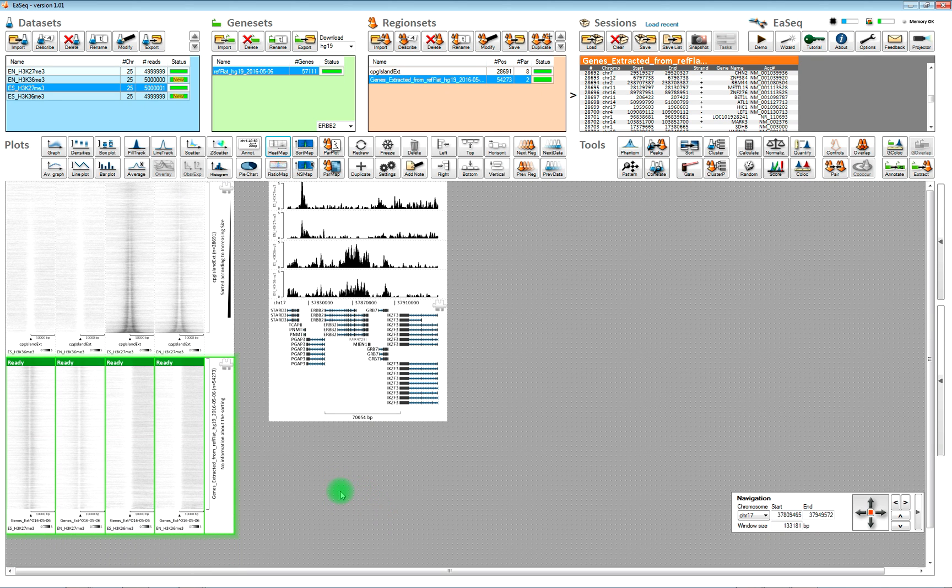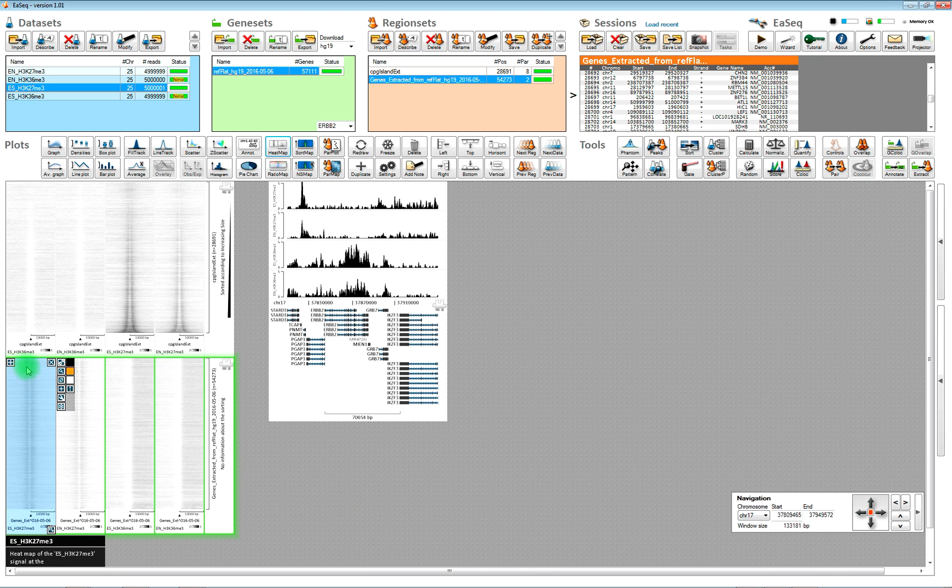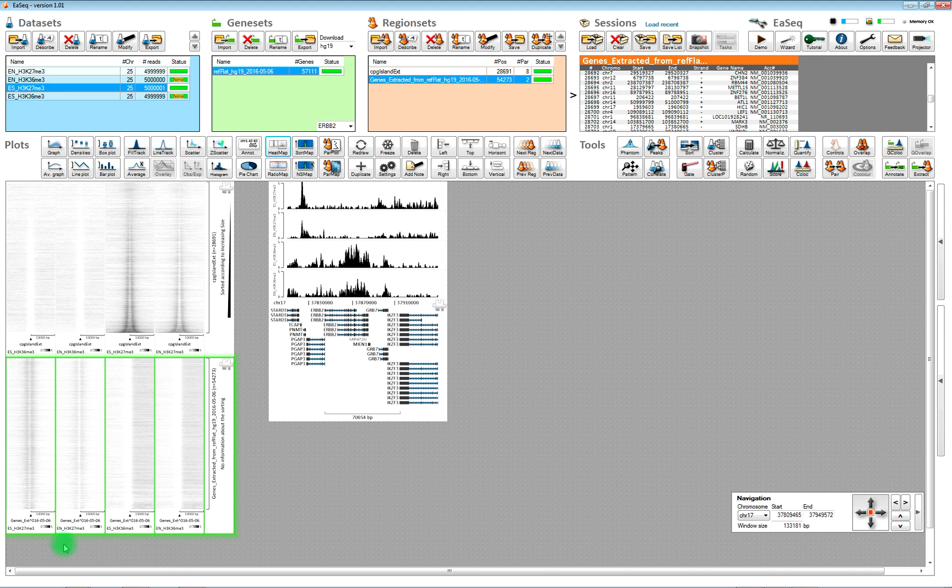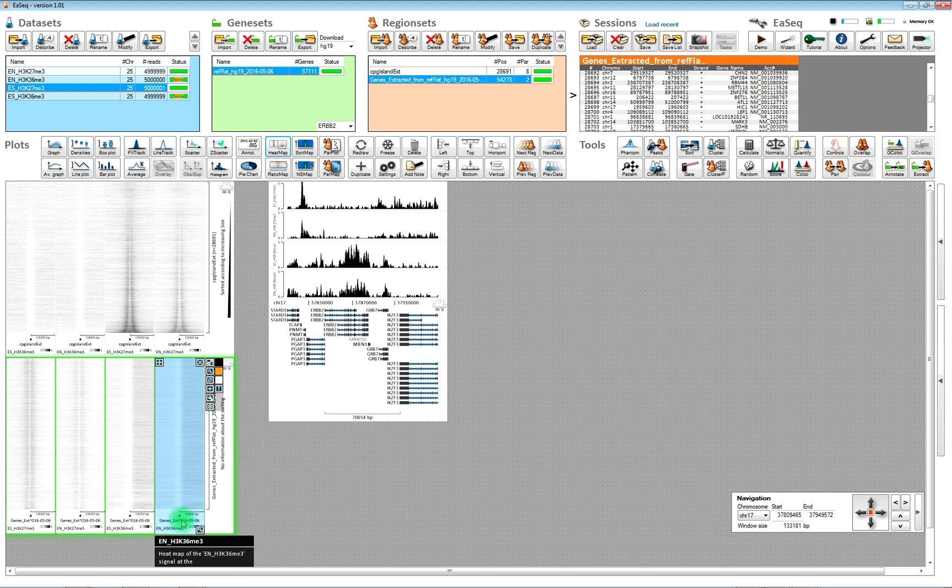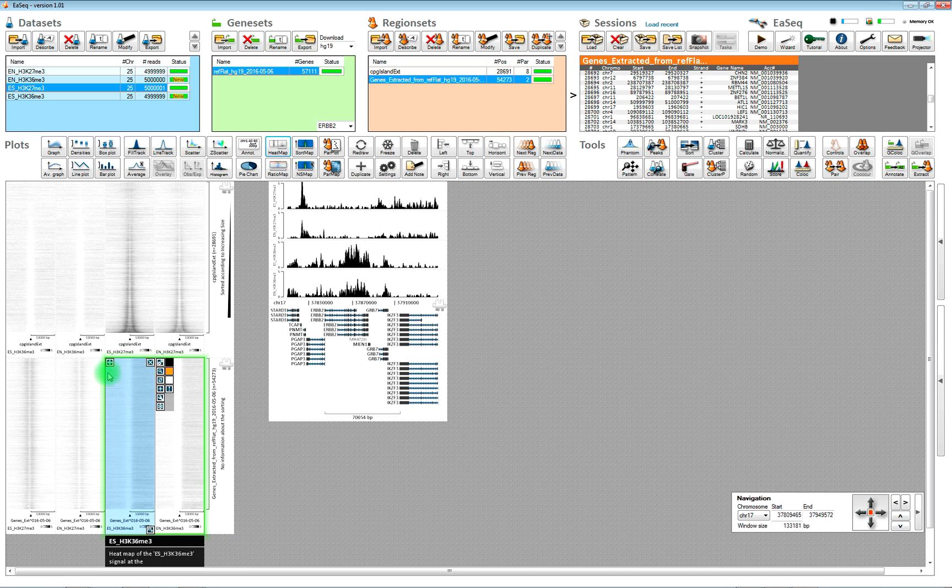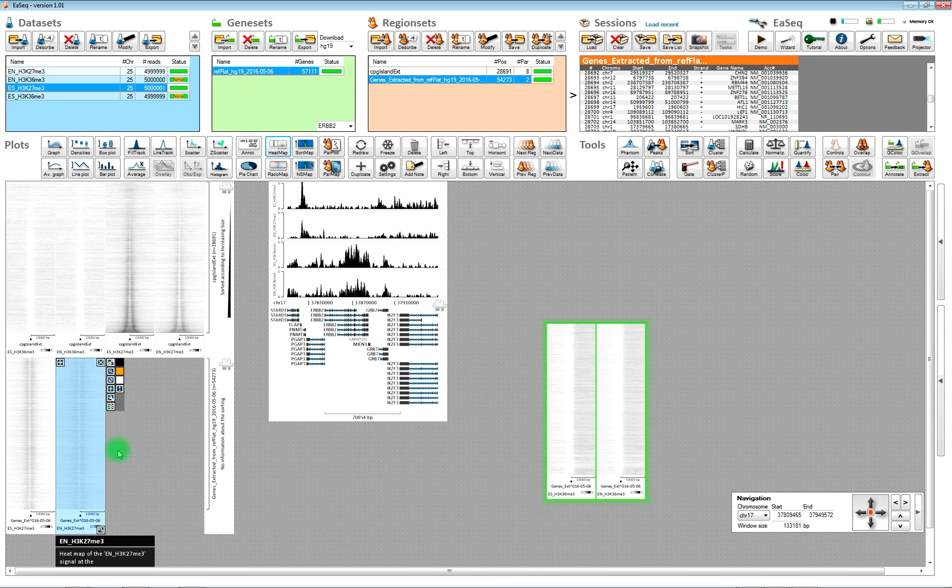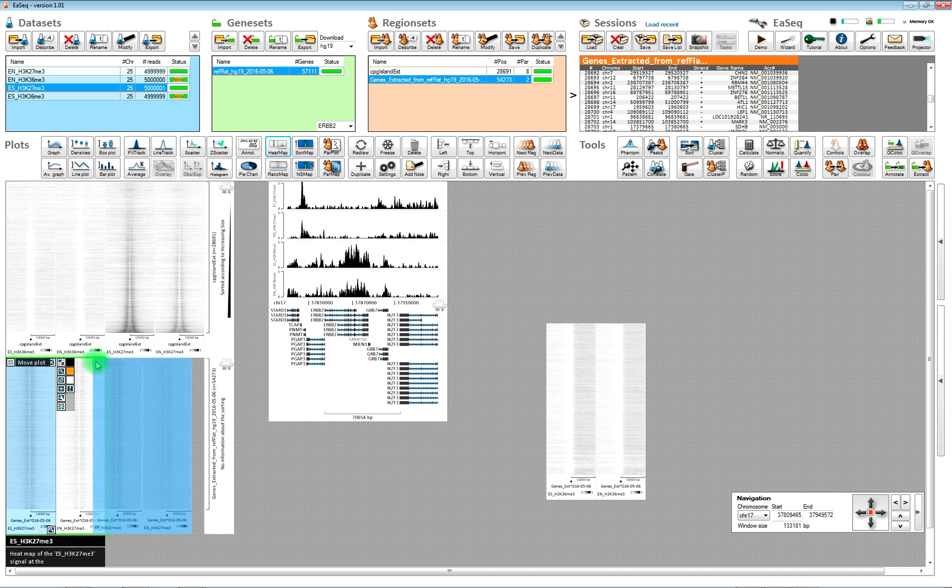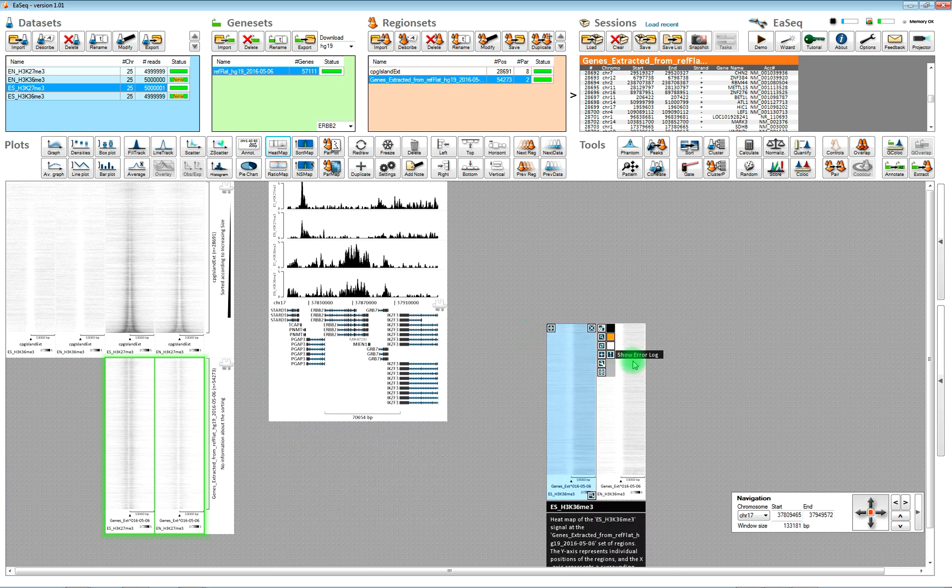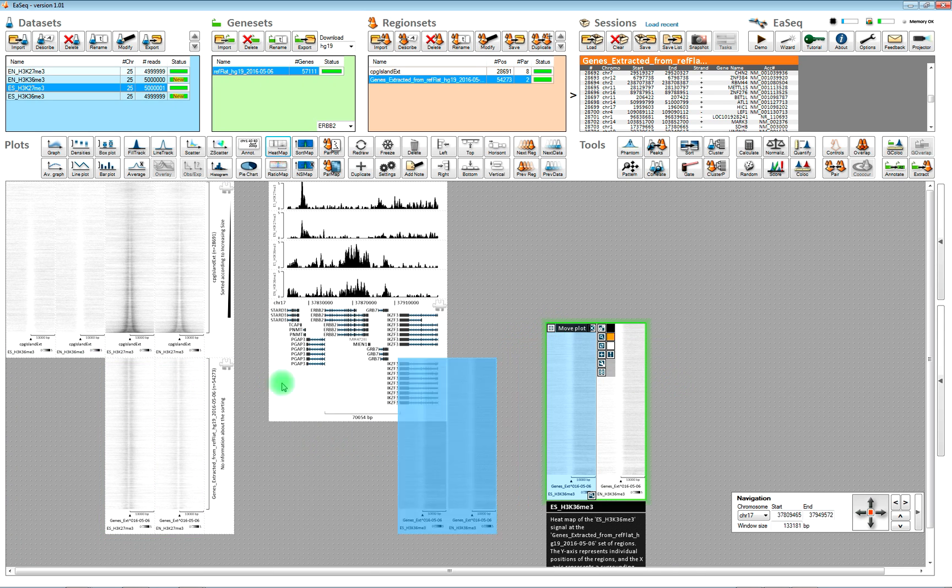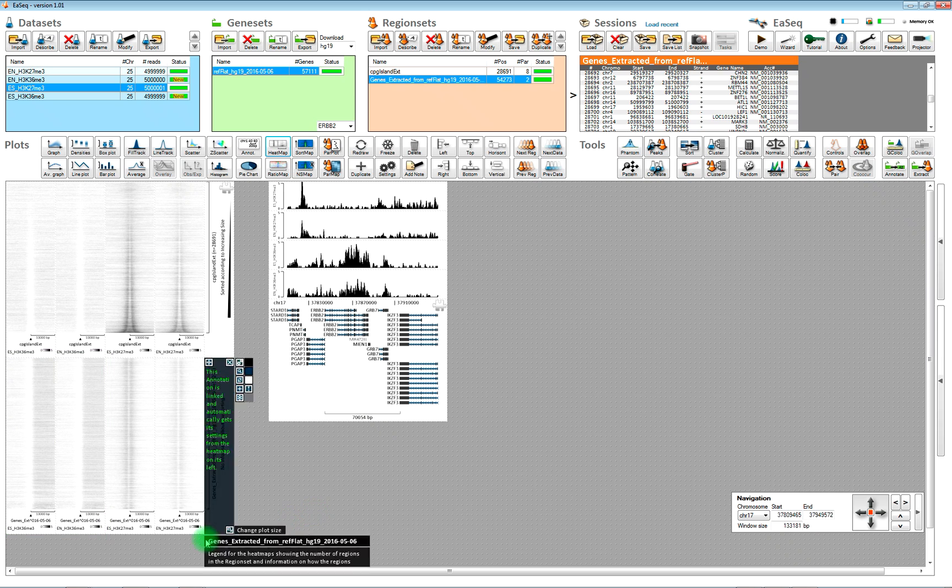Now you can see we have signal here. K36 signal downstream of the transcription start sites. Actually I didn't really manage to match the order so I can do that afterwards just by moving the plots around. Now it matches.